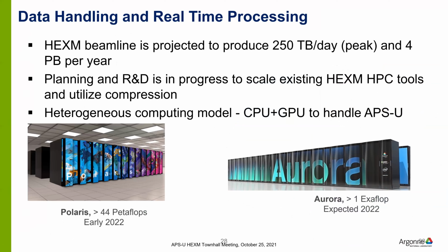Like I briefly alluded to, we're in the process of working with the ALCF community to deploy these data reduction and data analysis pipelines, and we hope to have on-demand computing resources, because this is a little different from how typical high-performance computing facilities work.